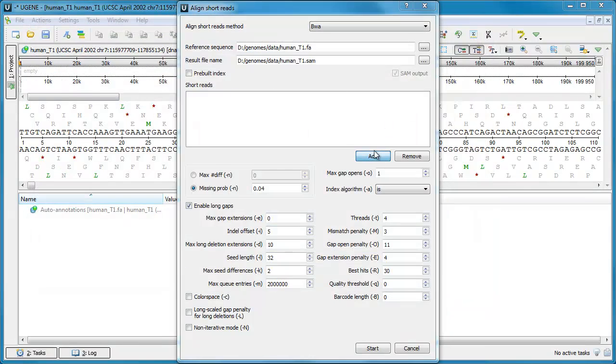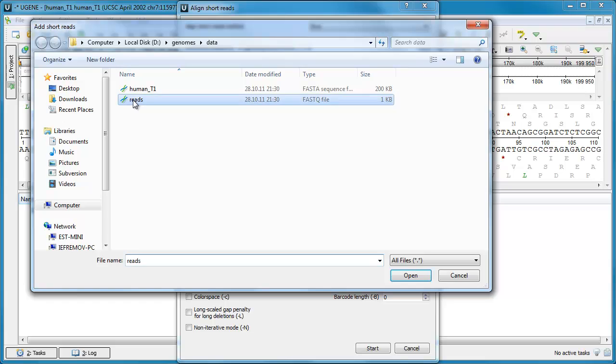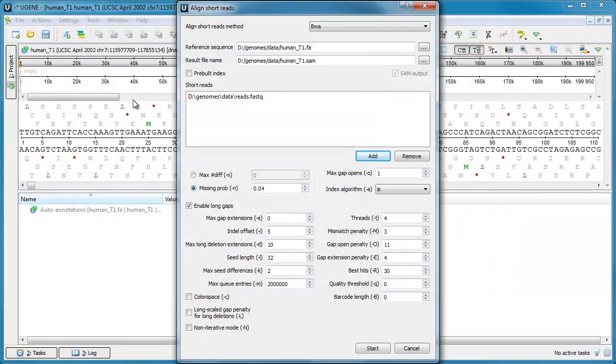Note that it is possible to use Burrows-Wheeler Aligner within UGENE on all supported operating systems, including Windows, which was not supported by the original BWA program.